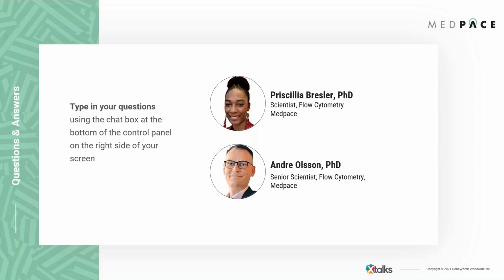Our next question is, how is the detection method decided in receptor occupancy? I can comment on that. You can look at your free receptor or your bound receptor, and you can perform accuracy and precision on that and see which one performs the best, and then go with the free receptor if that has greater accuracy, or go with the bound receptor if that has greater accuracy. So it comes down to precision and accuracy.